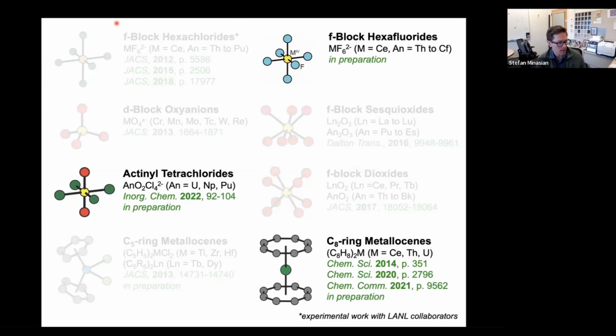No, I mean, I can tell you that we have done some higher energy measurements. So working at the carbon K edge is very different from working at the silicon K edge, for example. To get transmission at the carbon K edge, you have to have a sample that's less than 100 nanometers thick at least. But when you get up to the silicon K edge, sometimes you want to have samples that are several microns thick at least in order to get enough signal.